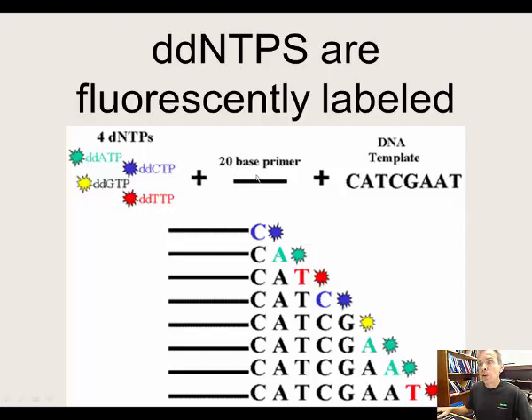Add these with a primer that you have chemically synthesized and your DNA template, and these nucleotides will be added in limiting amounts, will be added to the ends of that growing DNA. Now, once they have been added, the polymerization is ended because it's a chain terminating nucleotide, and so there is no additional extension of the DNA.